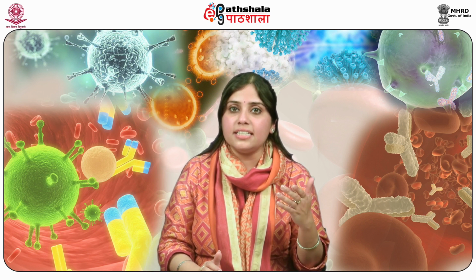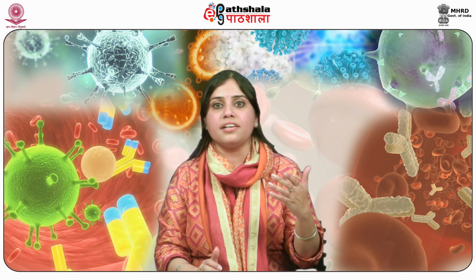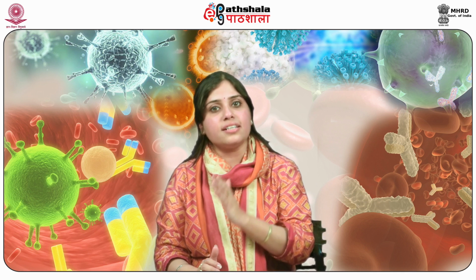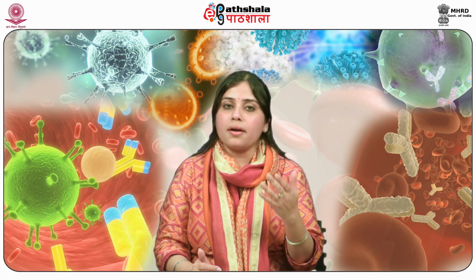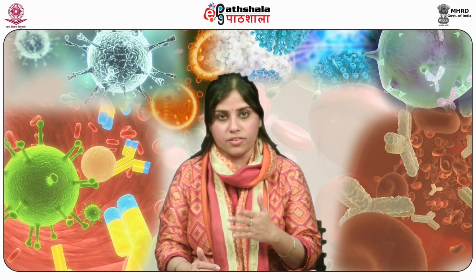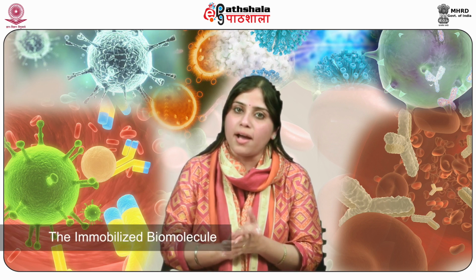Analyte binding leads to a subsequent increase in mass, and therefore a proportional increase in refractive index is observed as a shift in the resonance angle. The SPR procedure involves a flow injection comprising the analyte of interest dissolved in a buffer, traversing the sensing surface to network with the immobilized biomolecule.